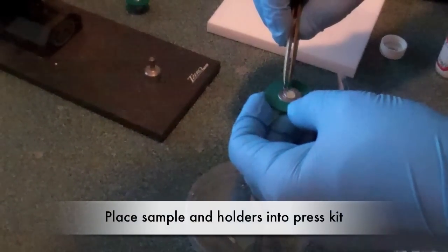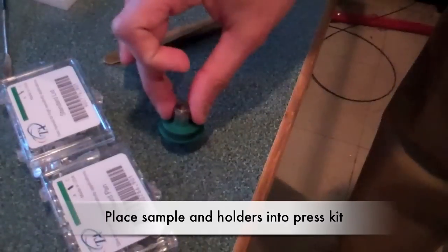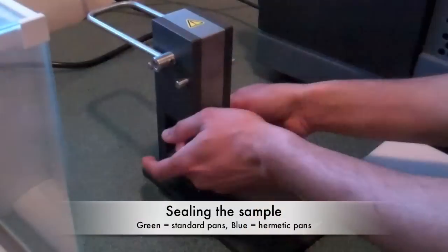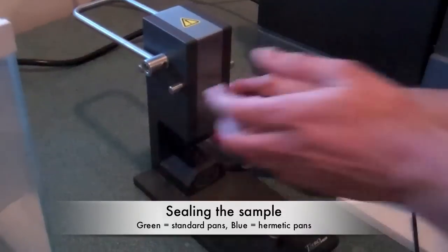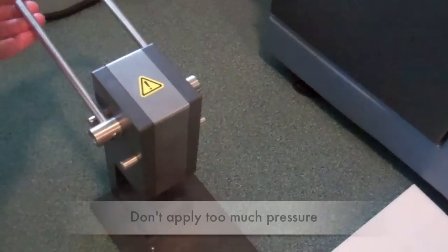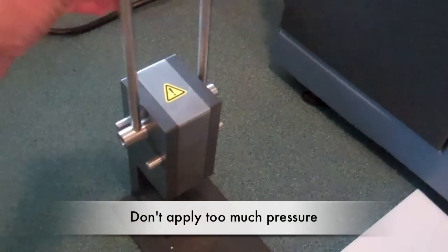Once the sample is weighed out, place the lid on and put the sample in the press kit to seal it. The green holders are for standard pans and the blue holders are for hermetic pans. Place the sample in the bottom holder and place both holder parts into the machine. Then lift the lever and lightly pull down to seal the sample. Don't apply too much pressure as the pan might be crushed.